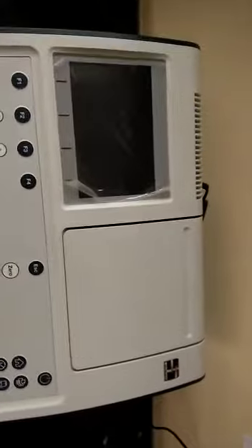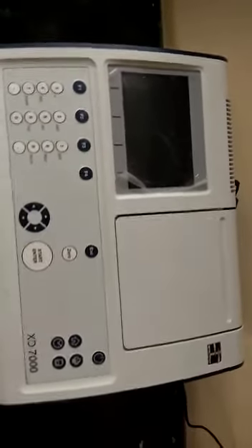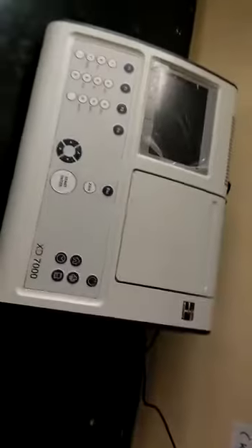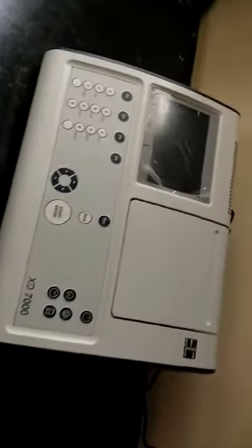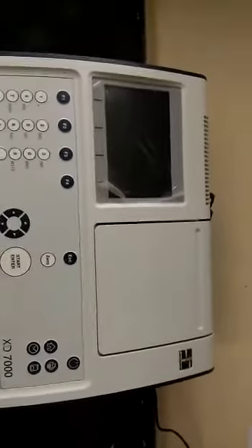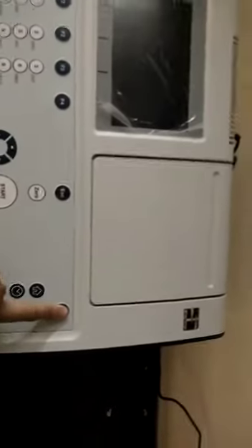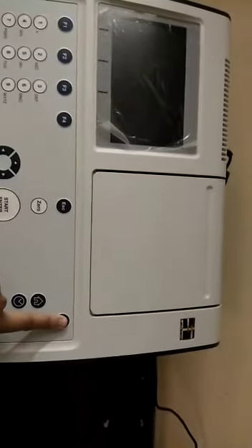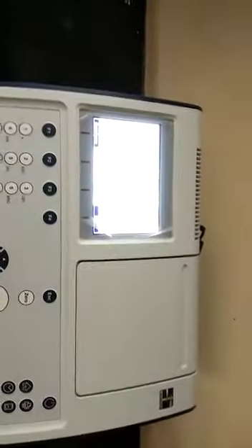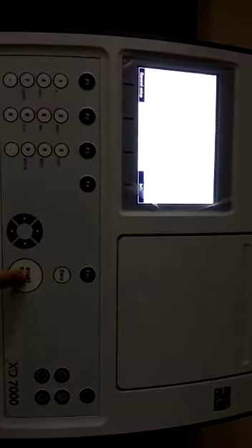Hi, let's see how the spectrophotometer works. I'm just turning it on here. It takes a couple of minutes to set up. I have just turned it on. Now let me press the power button. It's on, so it's asking us to please wait. Next, I'm gonna click the start button here.